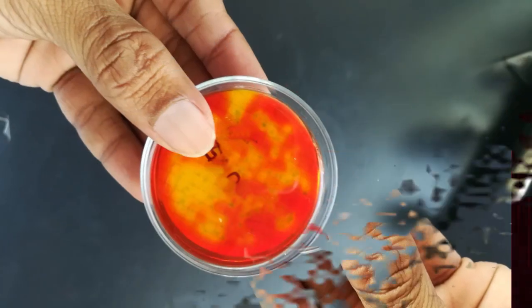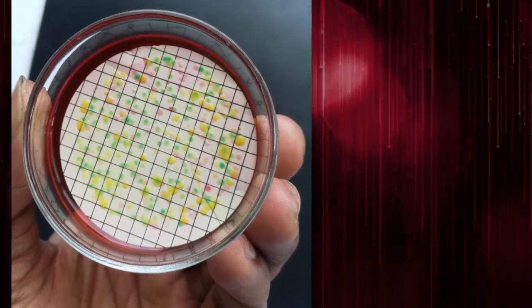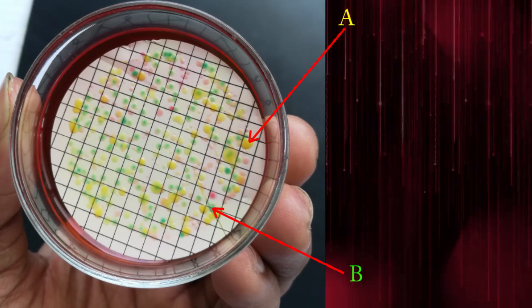This is Membrane Lactose Glucuronide Agar Media. Can you identify yellow color A organism and green color B organism?